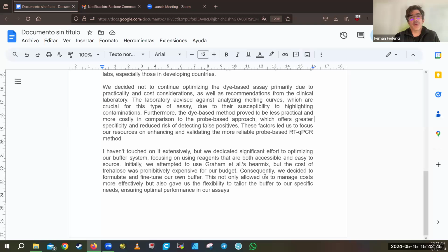So it was very useful to have access to this sort of tags and techniques, especially for a lab that has not specialized in protein production, as Ariel mentioned at the beginning. We collaborate with Cesar, but our lab doesn't work on protein production. So having access to this Reclone collection was super useful. Ariel can tell you more about what tags he used for this.